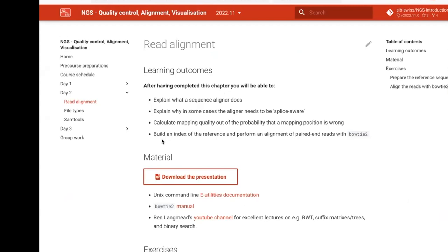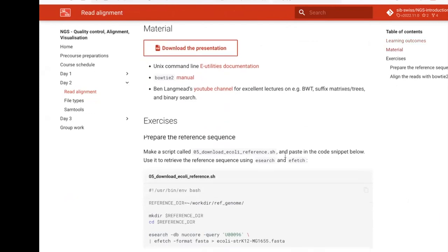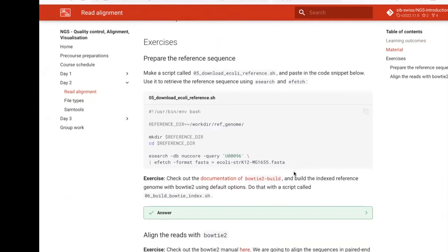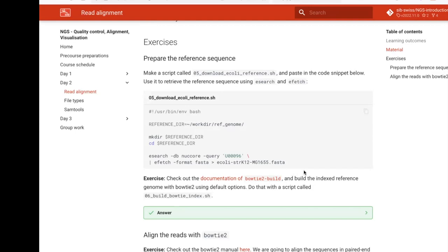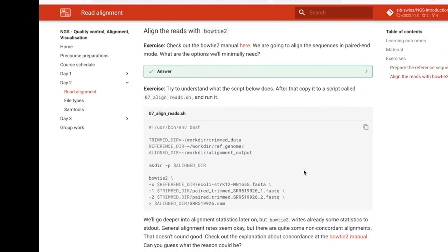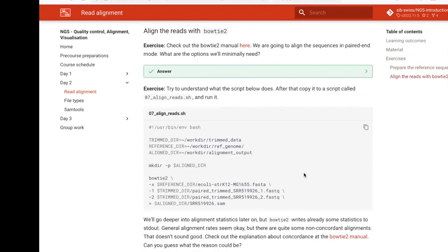Now let's move to the exercises on read alignment. You will download an E. coli reference genome using esearch and efetch from the Entrez e-utilities software, make an index, examine the files representing the Burrows-Wheeler transformation, and then align reads with Bowtie2 — which uses global alignment by default — on this prokaryotic organism.